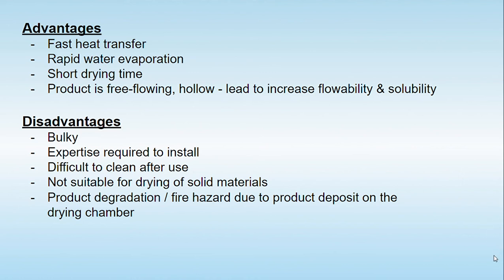As shown in the previous slide, the equipment is bulky and very big. Expertise is required to install it; you cannot install it as such. You need to control so many parameters to carry out the entire drying cycle. It is difficult to clean afterwards, because each and every part has to be cleaned.